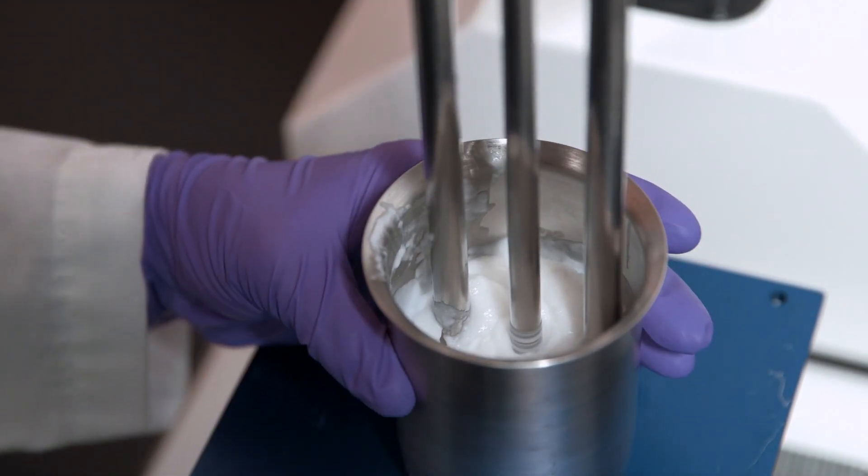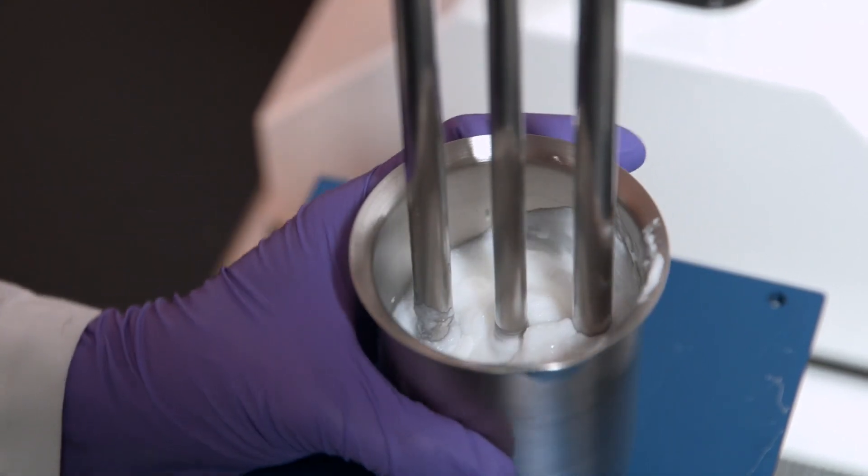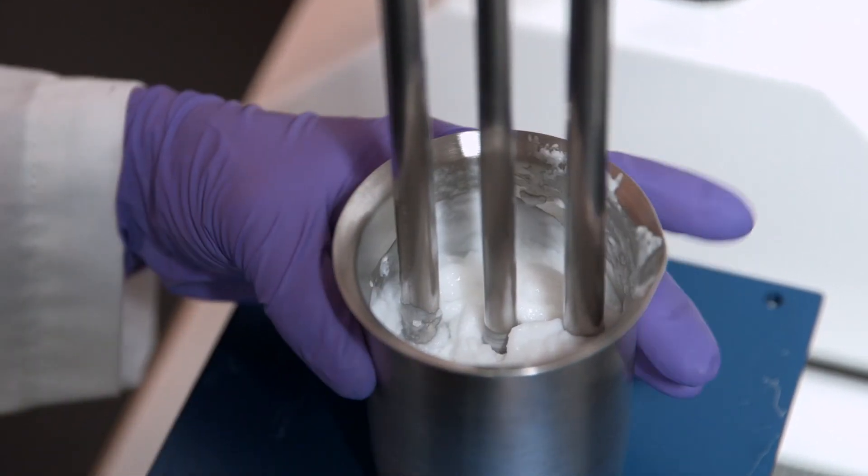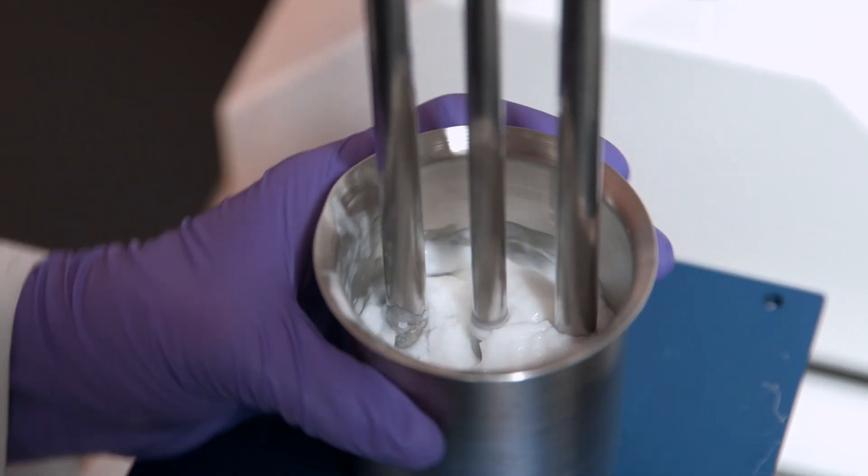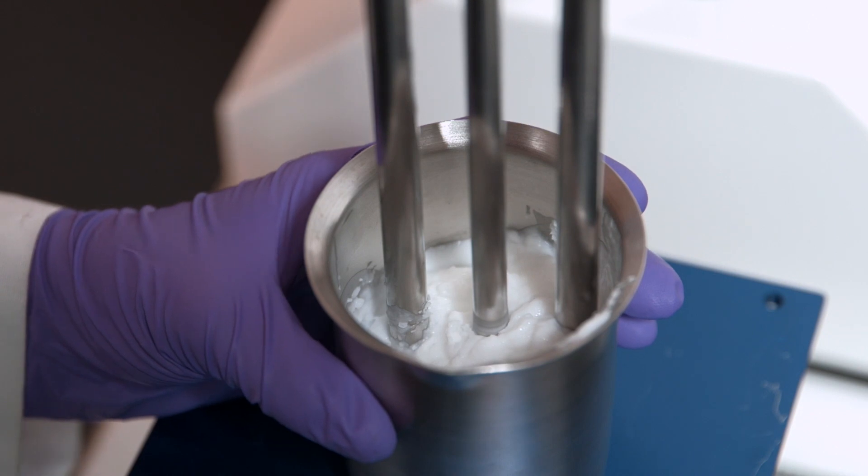The shear rate and the length of homogenization required is dependent on the formulation and also the equipment setup. But the critical consideration is ensuring that the homogenization process is not introducing air to the formulation.